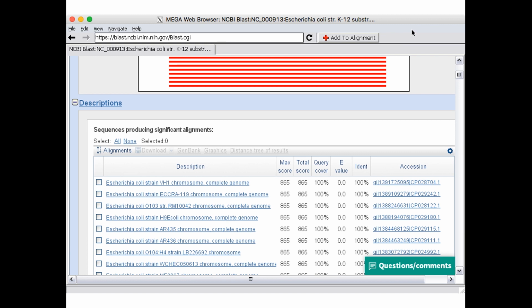But I have some rules for adding things. My first rule was I only want no more than 4 species from each genus, and I only want 1 sequence from any species. I've got my E. coli. So I certainly don't want any of these, especially since they're all the same sequence. They match at 100% match.